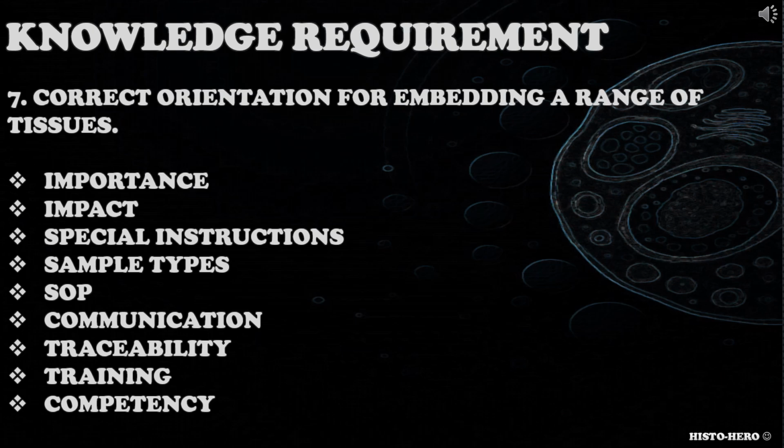Consider the impact of embedding on the sample and the patient, the importance of correct orientation, the impact of poor orientation, special instructions, sample types that require orientation during embedding, method for orientation, way of communication for orientation. Also consider traceability, training, and competency.